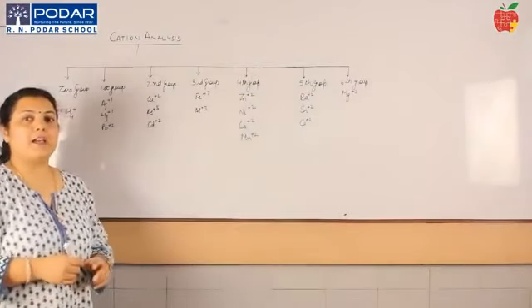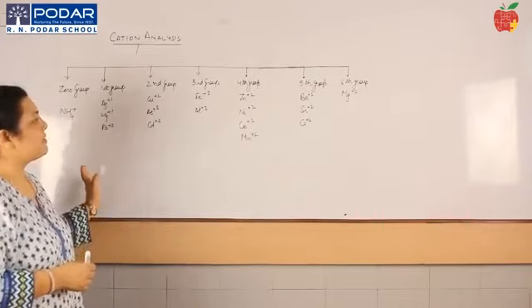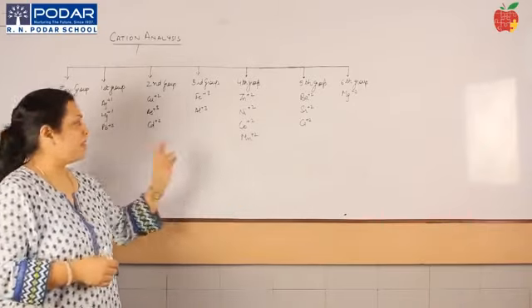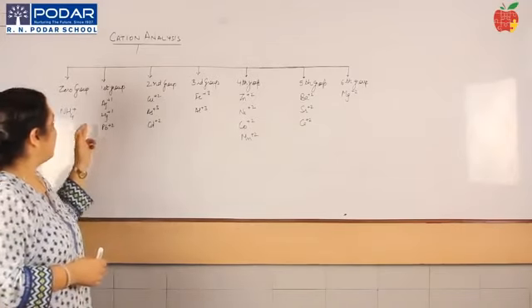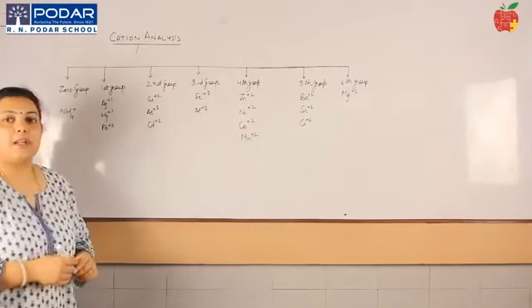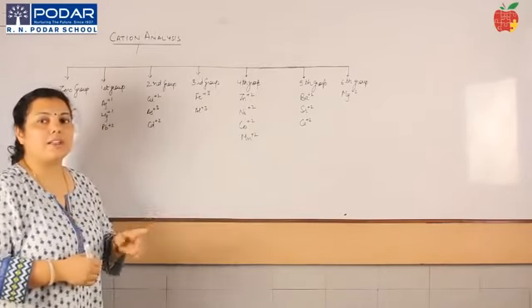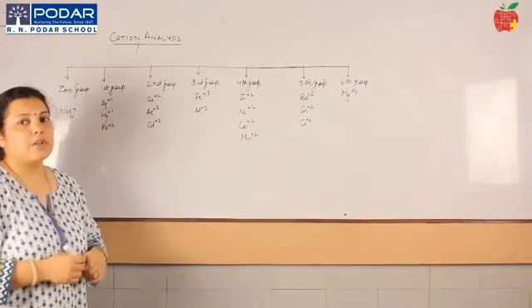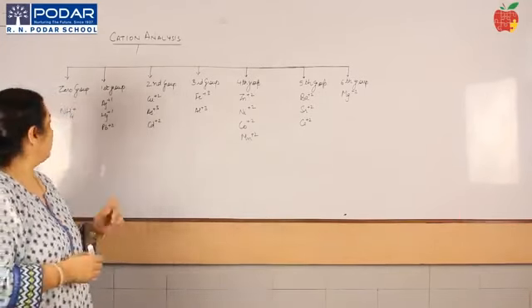After analyzing the anions, you will analyze a cation. Cation analysis is divided into 7 groups. We start with the 0th group, which has ammonium as the cation. Ammonium is done in the beginning because we use many ammonium reagents during the analysis in the 3rd group, 4th group and 5th group. To avoid any kind of confusion, ammonium is kept in your 0 group.